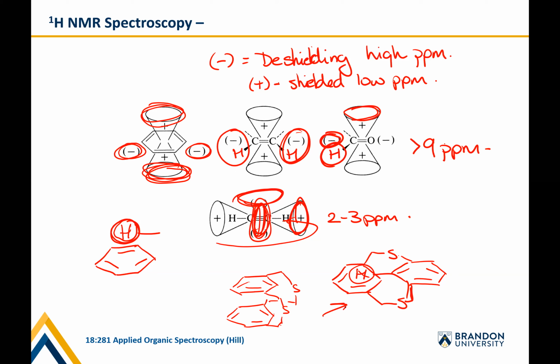And they would flip in between. You could make them rotate and flip in between. You could actually monitor this by checking the chemical shift of this proton here, because it would be in a zone of de-shielding, and then as it rotated around, it would be over the ring, in a zone of shielding. You could actually watch the proton migrate from high chemical shift to low chemical shift using a technique called variable temperature NMR. And you could get the kinetics of how these things flipped and flopped and all that sort of fun stuff. So it's interesting.